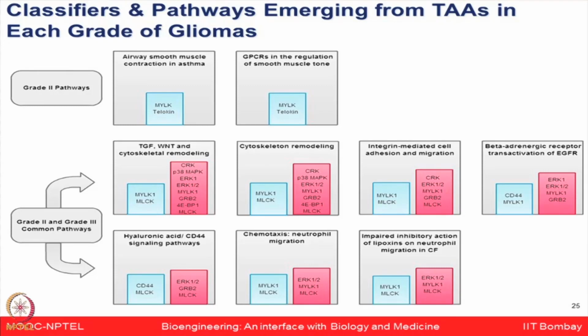This kind of analysis also gives us a much better understanding of what is happening physiologically in these patients. For example, when the disease progresses from the low grade to the higher grade, from grade 2, 3 and 4, what kind of genes and what kind of proteins are being expressed. Are there some new unique proteins appearing as the disease progresses, and what kind of major pathways are being changed. Those kinds of studies even basic molecular biologists can do by using this kind of high throughput screening.